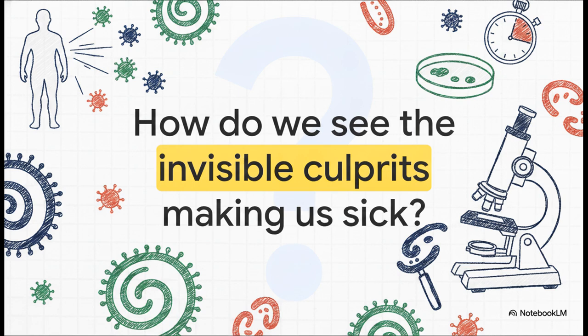Seriously though, have you ever wondered how we actually see the invisible culprits making us sick? Picture this. A patient comes in with a severe infection, and the clock is ticking. We literally can't afford to wait days for a time-consuming lab culture to finish before making a life-saving call. We need clues, and we need them fast. That is exactly where the incredible tool of direct microscopy swoops in to bridge that gap.